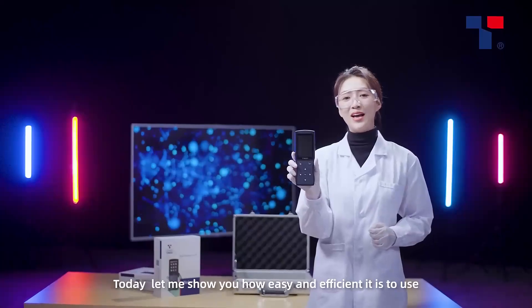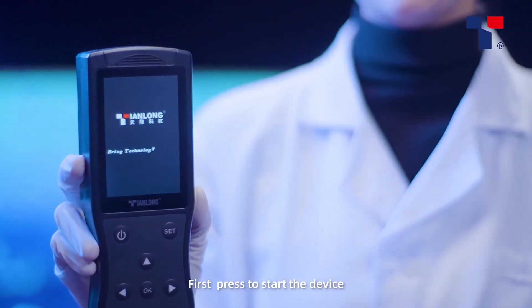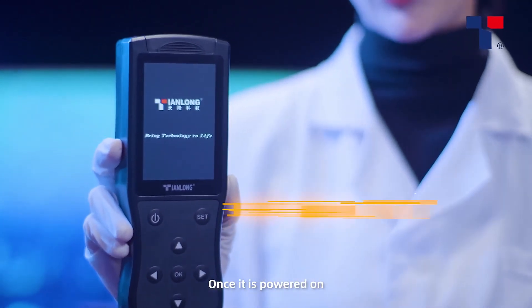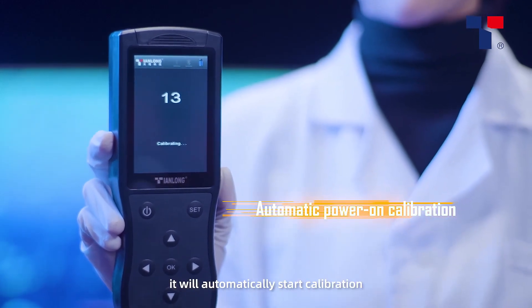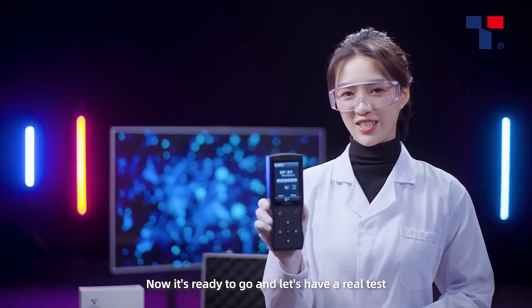Today, let me show you how easy and efficient it is to use. First, press to start the device. Once it is powered on, it will automatically start calibration. Now it's ready to go and let's have a real test.